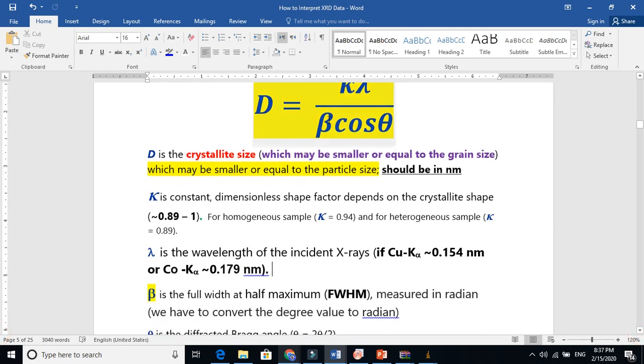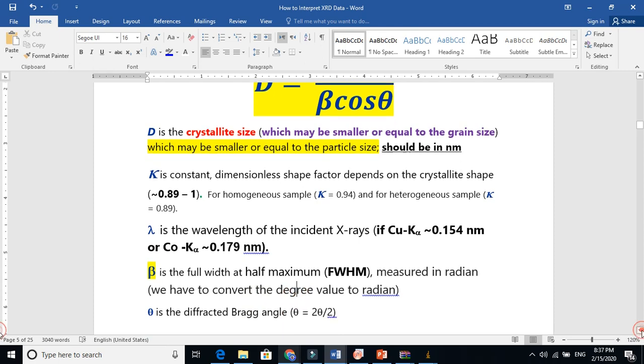This beta is basically the full width at half maxima. And we will measure this in radian, because I told that it is basically in degrees, but we have to convert this into radians. And theta is basically the Bragg angle, and when you take 2 theta, if you take 50 here for 2 theta, we have to divide by 2, and it will be equal to 25 degrees.